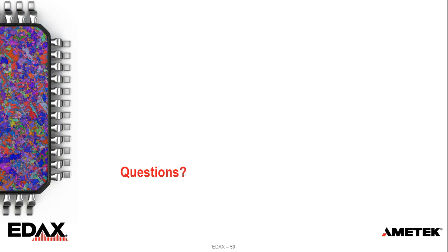Yes, so there is a question from Justin Axel that asks if we have investigated formamidinium lead iodide-based perovskite. The answer is yes. I've tried to measure the formamidinium lead iodide. However, at least in my experience, we had some issue with the conductivity of this particular sample, because the formamidinium lead iodide can easily go back to the delta phase, the yellow phase, which is the non-conductive one.